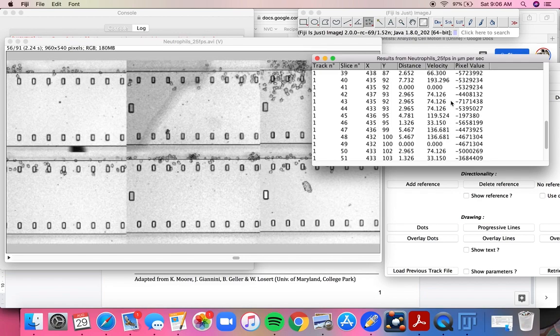And in this stretch here, yours won't necessarily be the same. You won't necessarily pick the same white blood cell. In fact, I encourage you to pick a different one. There's many here to choose from. But you can kind of see this is the range.